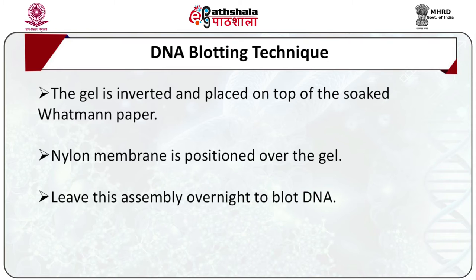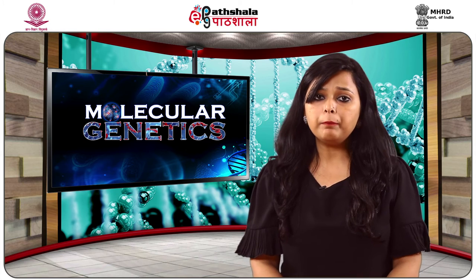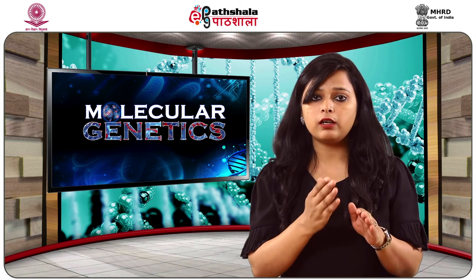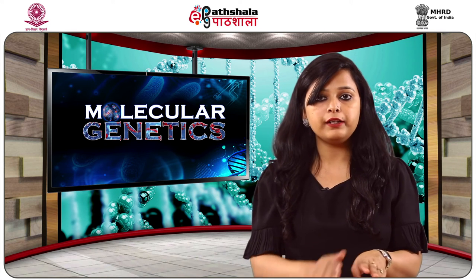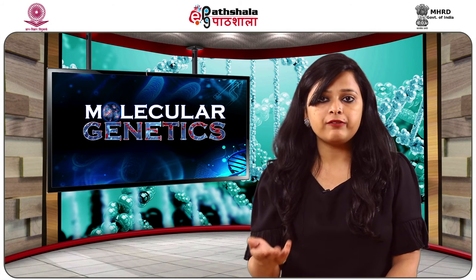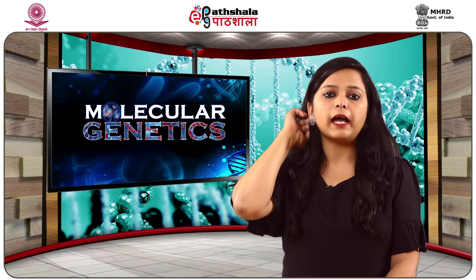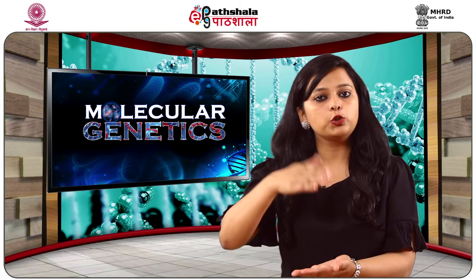The piece of nylon membrane is soaked in 20x SSC and positioned over the gel, avoiding any air bubbles trapped between the gel and the membrane. Pieces of Whatman 3 mm paper are placed on the wet nylon membrane. Above it, a stack of cut blotting sheets is placed. A horizontal smooth rectangular surface with a weight of around 500 grams is then placed over the stack of blotting sheets. This assembly is left undisturbed overnight to allow the transfer of DNA from the gel to the membrane.